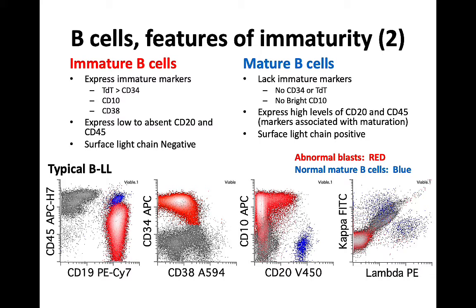Let's consider this example of a typical B-lymphoblastic leukemia. This sample is taken from a patient with B-lymphoblastic leukemia — the abnormal blasts are highlighted in red, whereas the normal background mature B-cells are highlighted in blue. In the first plot of CD45 versus CD19, the blasts are CD19 positive, confirming B-cell origin, with low-level CD45 as one marker of immaturity. In the next plot, they're CD34 positive. In plot 3, they're bright positive for CD10 and essentially negative for CD20 — contrast their position on the CD10 versus CD20 plot from the normal background B-cells in blue.